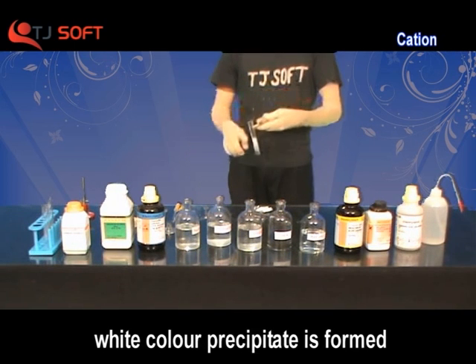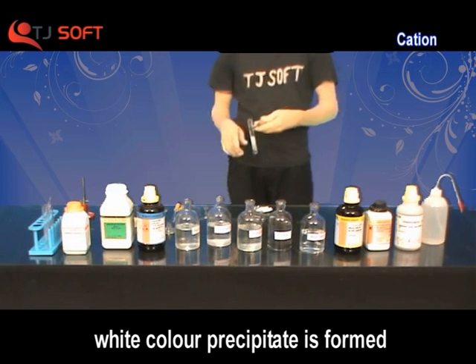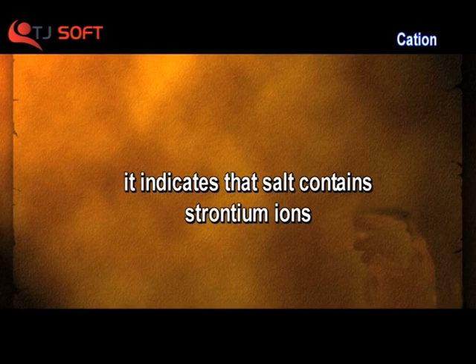Here we observe a white color precipitate forming in the test tube. This indicates that the salt contains strontium ion.